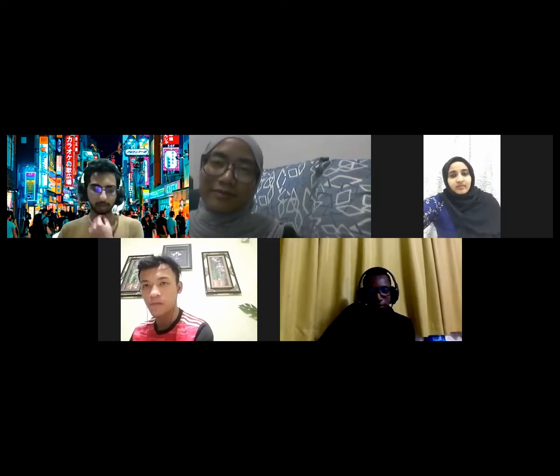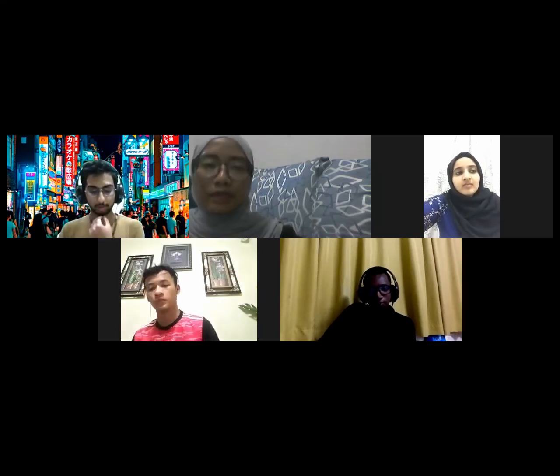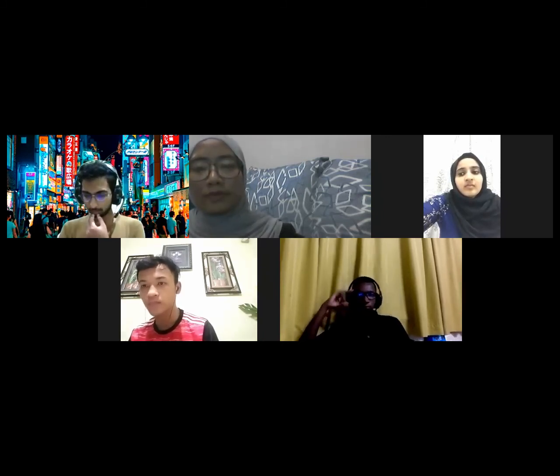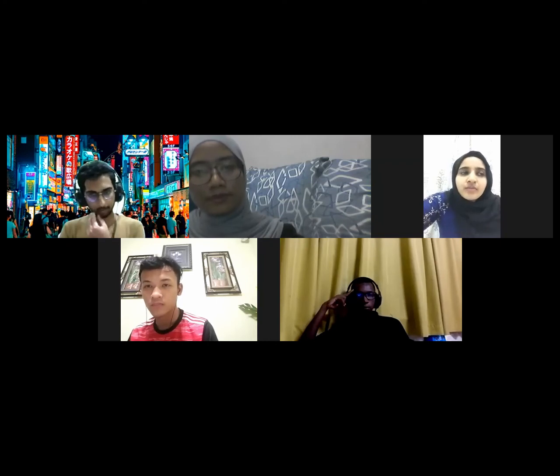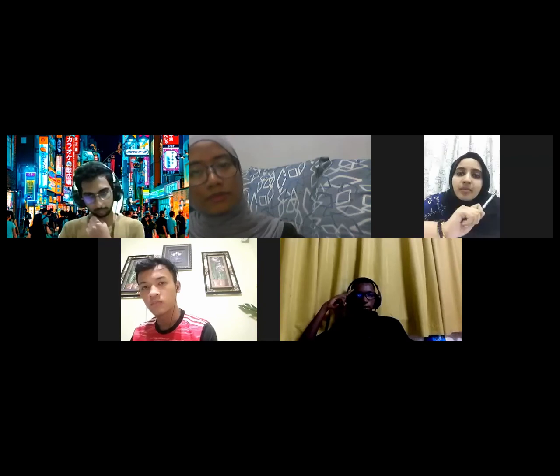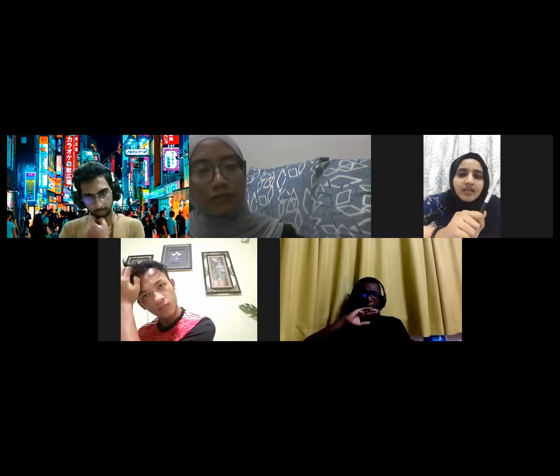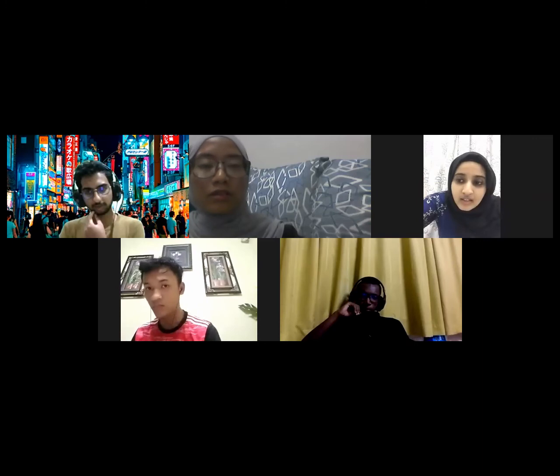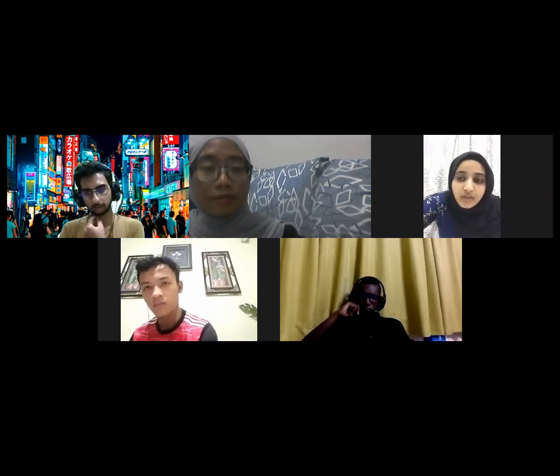But I think we can also ask some of our friends to perfect our primer, make a good primer. So actually, I did ask a few groups. Some of them didn't even start from the very beginning. They start from the middle, anywhere, where they think it's rich in GC content.